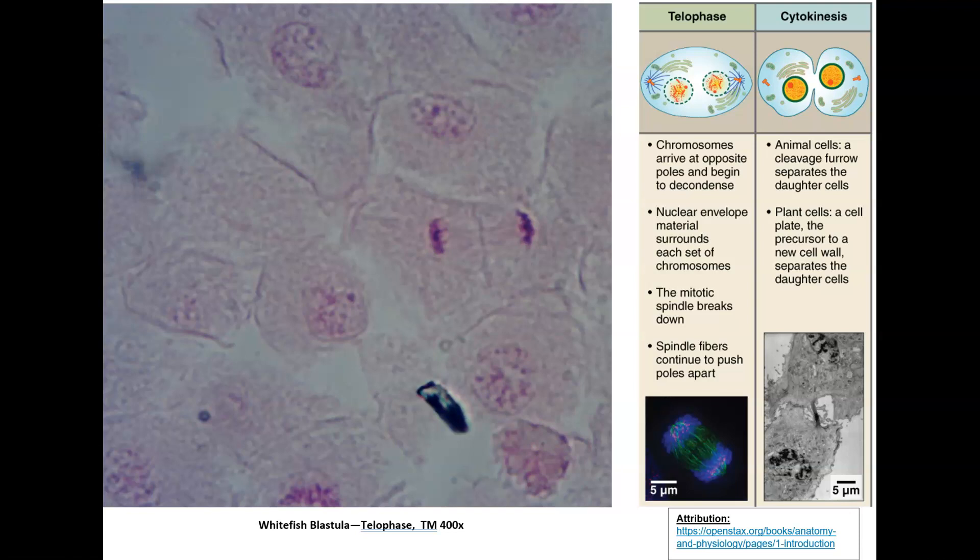Did you find the telophase cells? It's these two right here. We know because we can see the cleavage furrow, and we can also see the remainders of the spindle fibers.